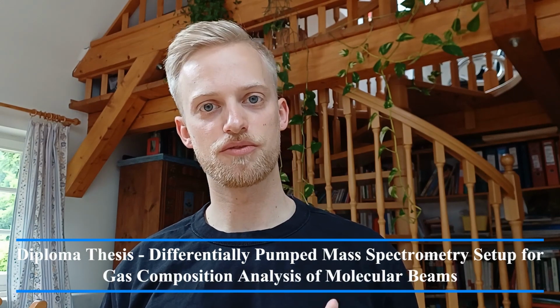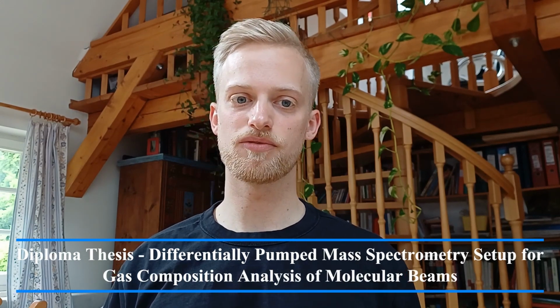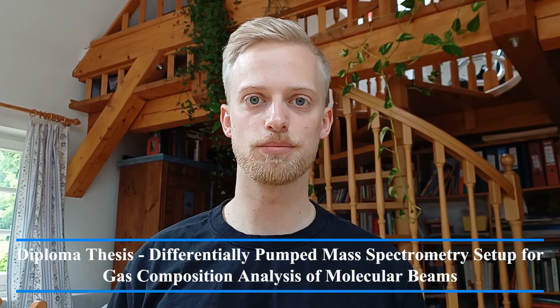Welcome to this short video in which I would like to give you a small insight into my diploma thesis titled Differentially Pumped Mass Spectrometry Setup for Gas Composition Analysis of Molecular Beams.